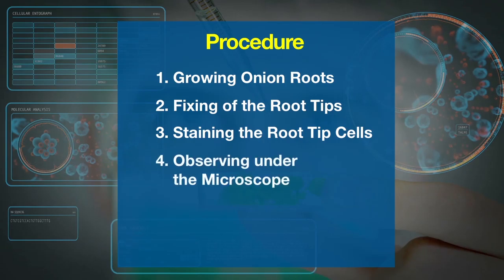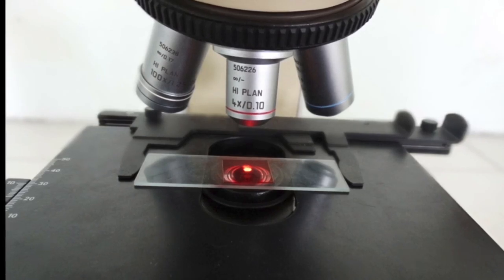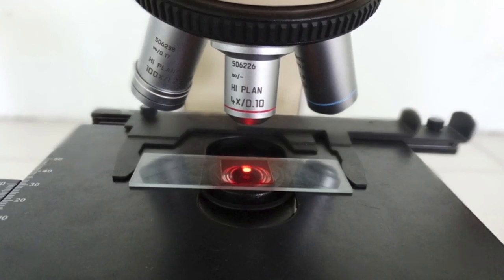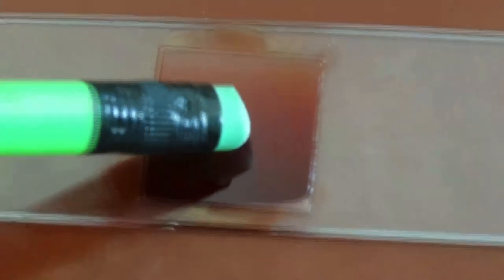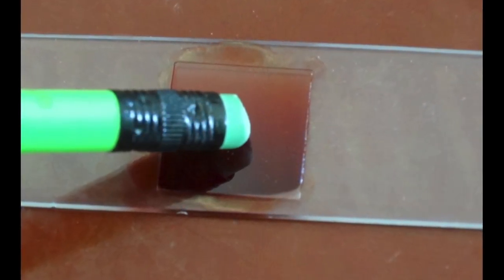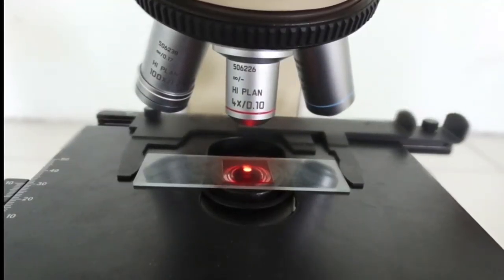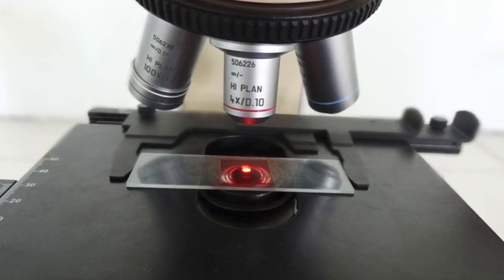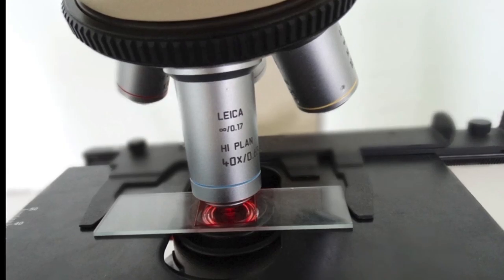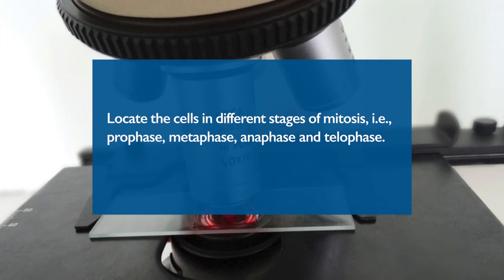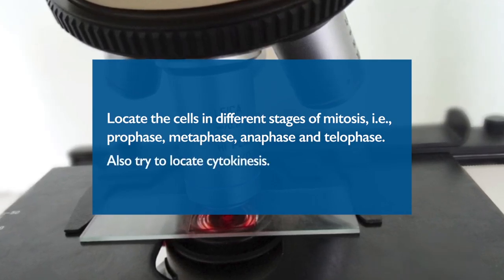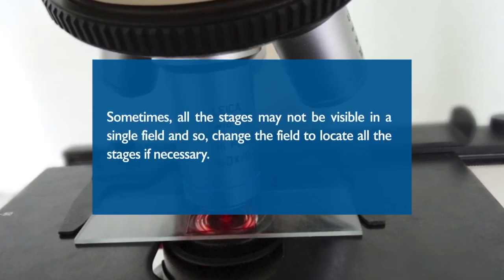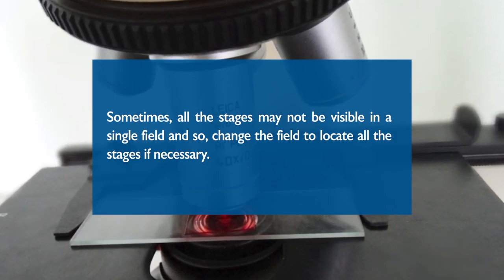The next step is observing under the microscope. Place the slide under the 10x objective of a compound microscope and scan to see if the cells are spread in a monolayer. If the cell spread is thick and does not form a monolayer, take out the slide and squash the cover slip again with the pencil eraser. Once a nicely spread monolayer of dividing cells is visible, switch to the 40x objective. Examine the cells and identify the different stages of cell division: prophase, metaphase, anaphase, and telophase. Also try to locate cytokinesis. Sometimes all the stages may not be visible in a single field, so change the field to locate all the stages if necessary.